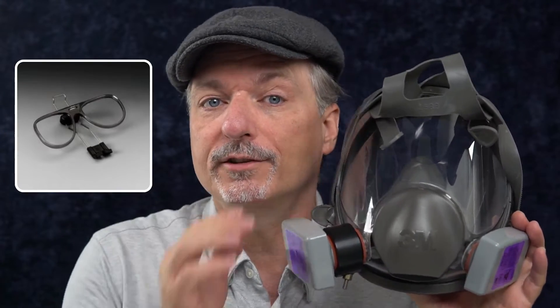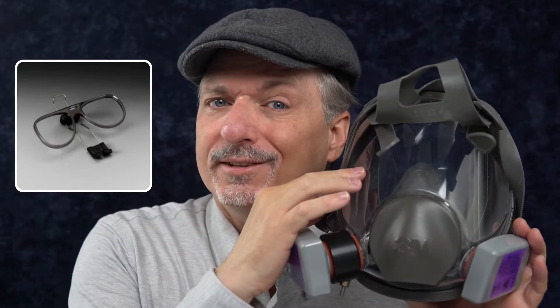A question came up on Twitter — someone wanted to know: what do you do if you need to wear prescription lenses with a full face mask like this? Well, the answer is 3M makes a special insert that allows prescription lenses to fit inside, but it's expensive, and you've got to put prescription lenses in it.